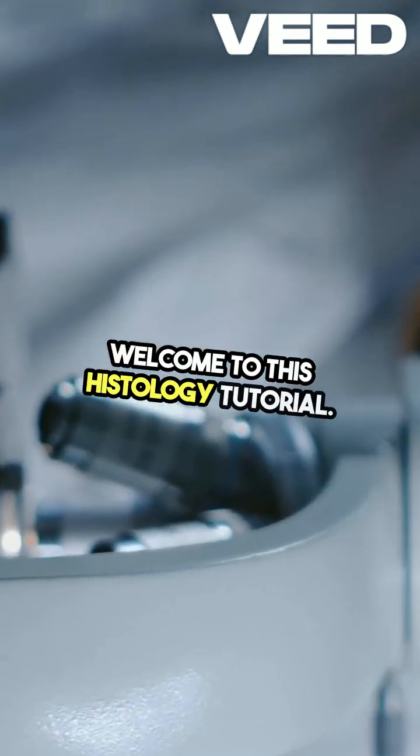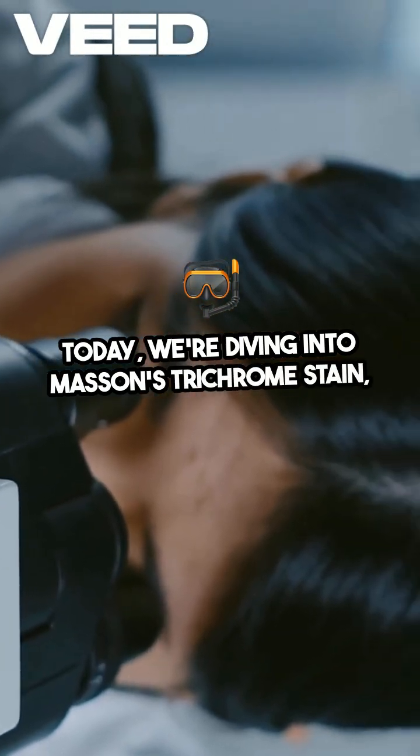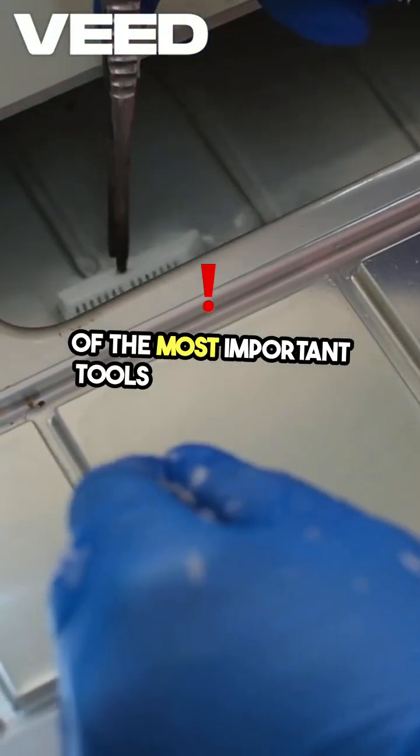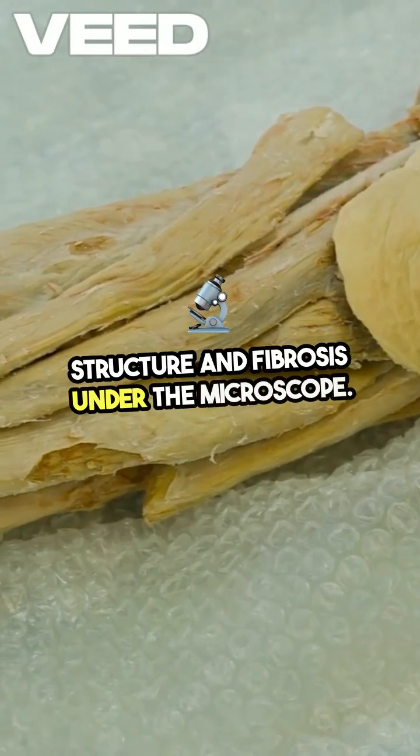Welcome to this histology tutorial. Today we're diving into Masson's trichrome stain, one of the most important tools for visualizing tissue structure and fibrosis under the microscope.